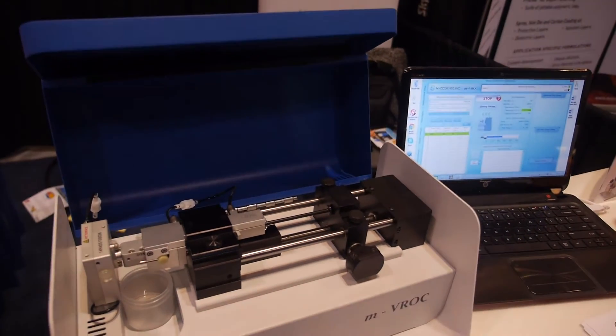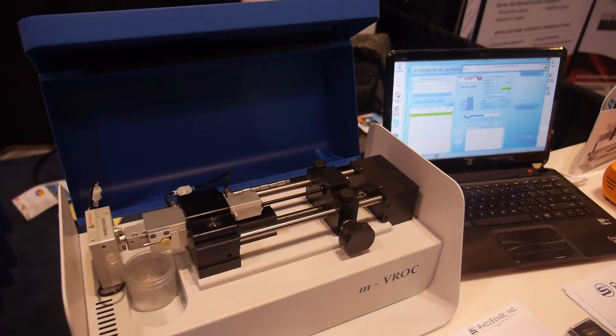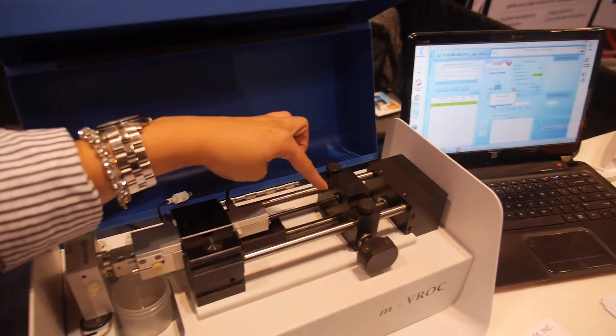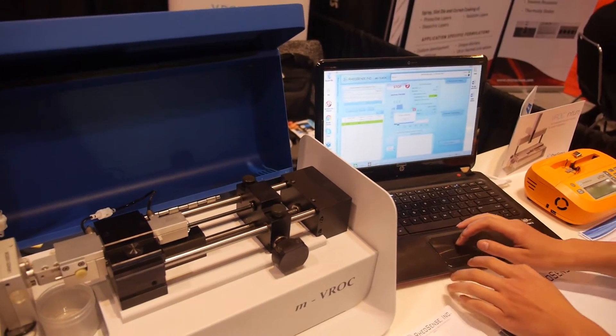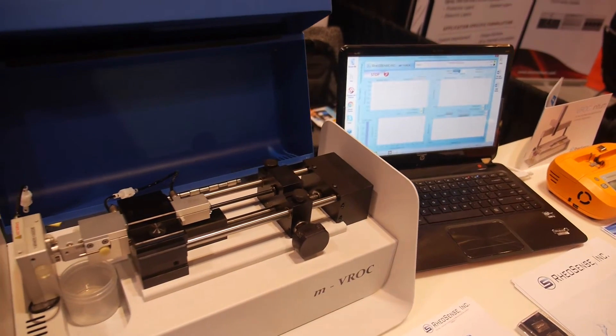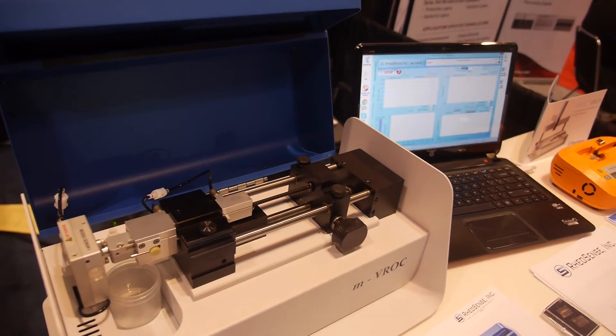So what's going to happen now? Lulu just made the pump detect the syringe. Now that it's detected, we can go ahead and start the measurement. Lulu pressed start, so the viscosity measurement will now take place.